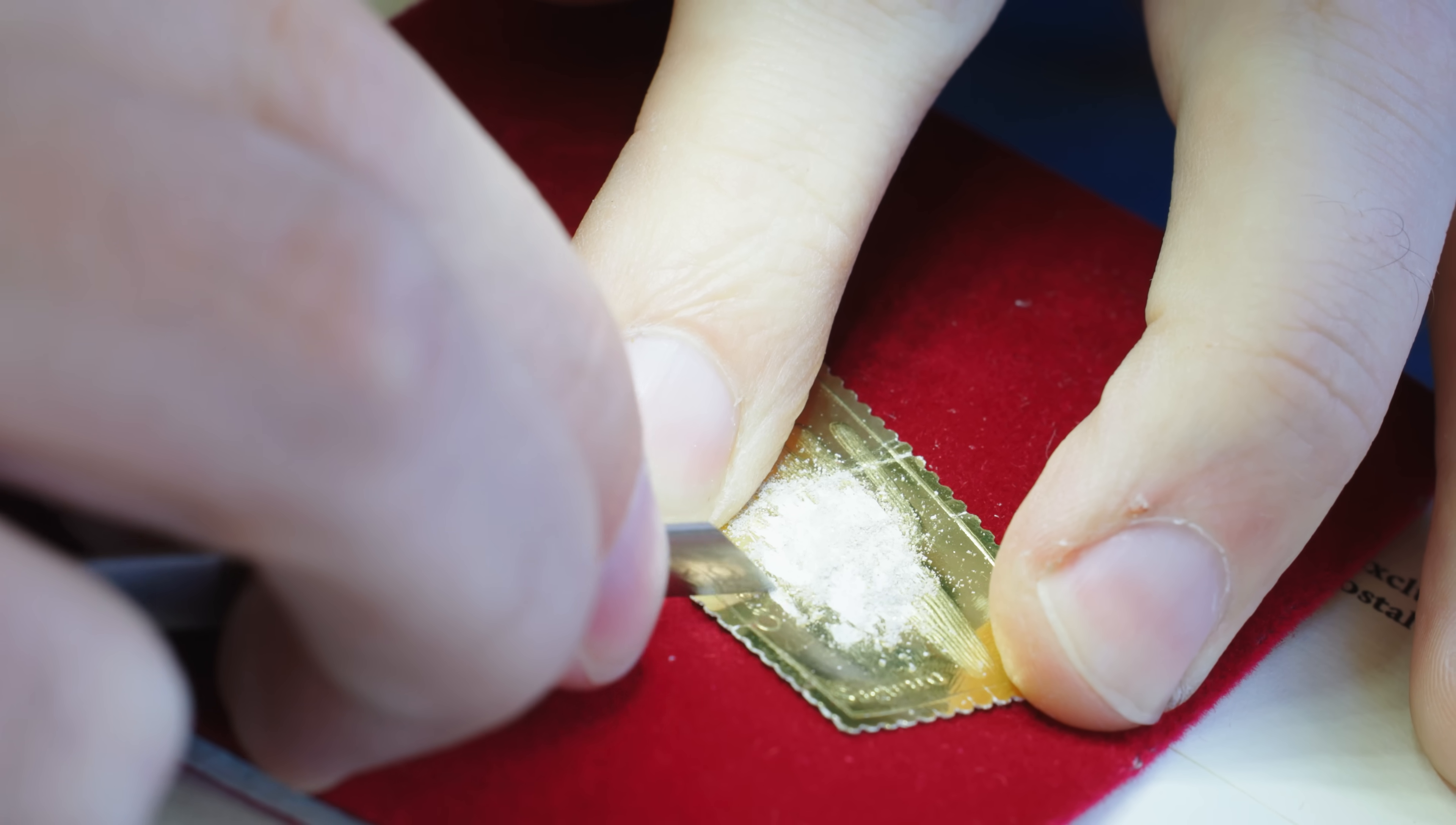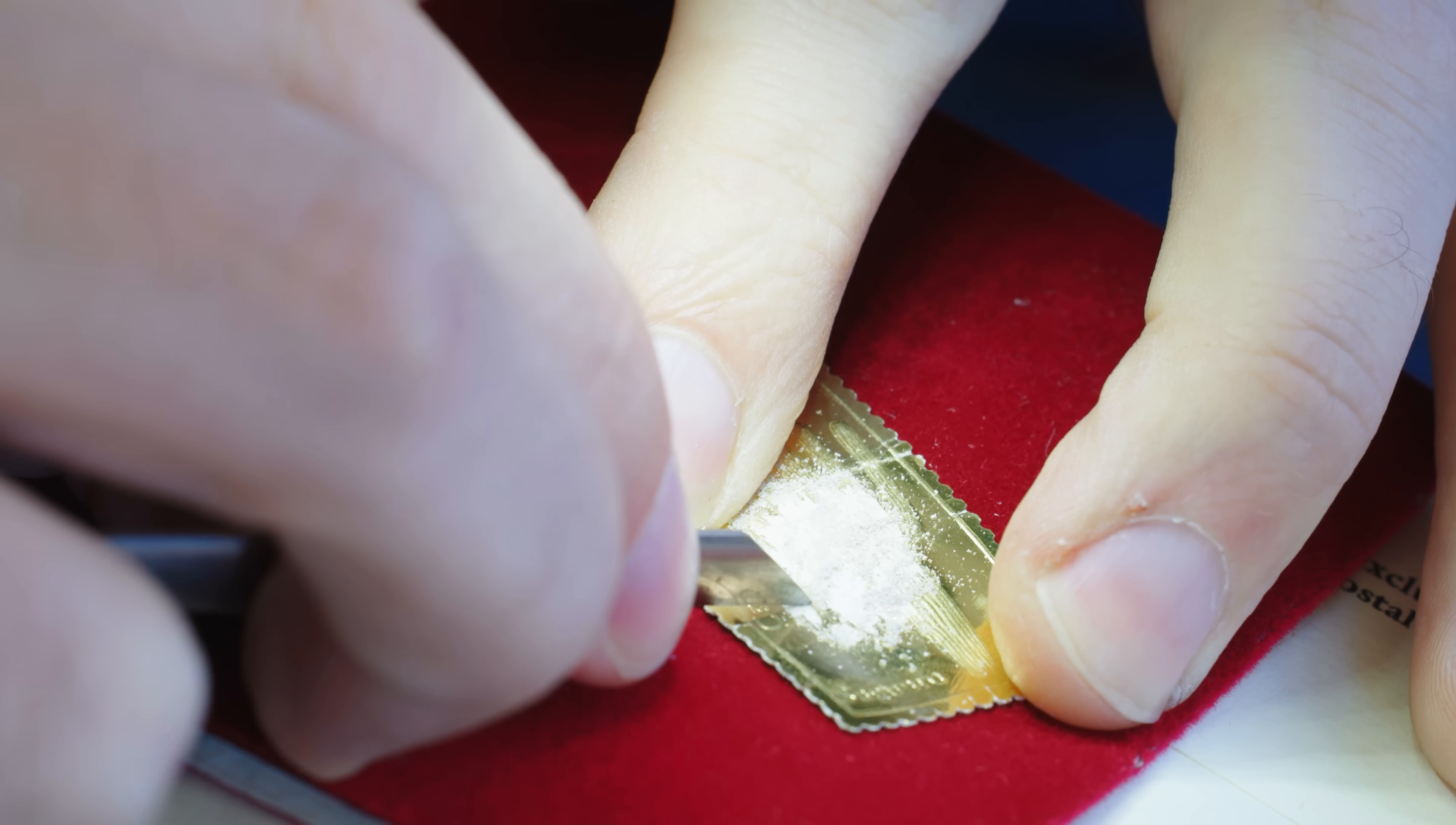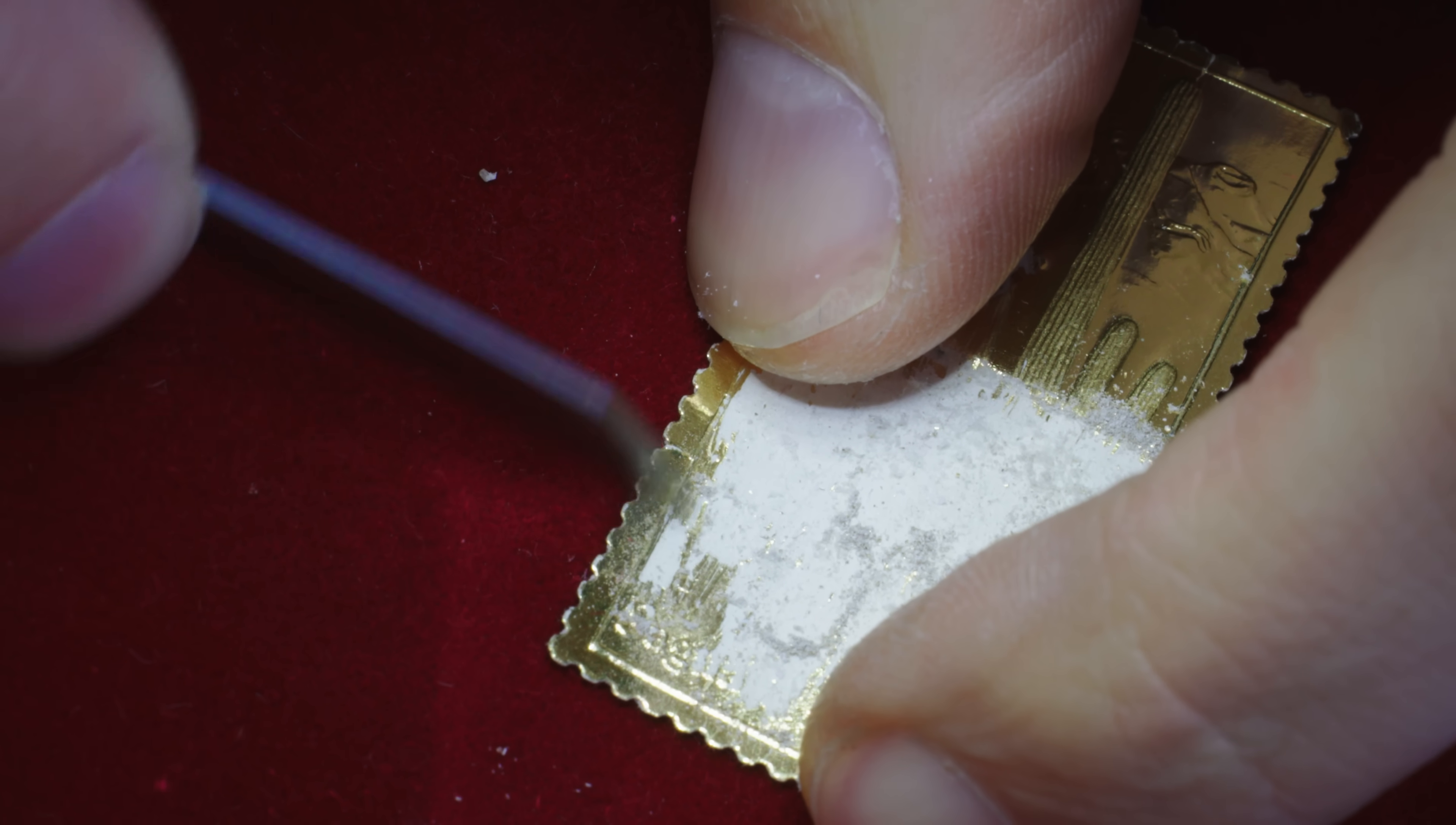So the first thing I was thinking is that there's a lot of paper on these gold stamps. So because of that, I don't want to necessarily just burn down the stamps directly. I want to see if I can remove the gold by itself while maybe getting rid of as much paper as I can. And the best way I could think to do that was simply by scraping the gold off.